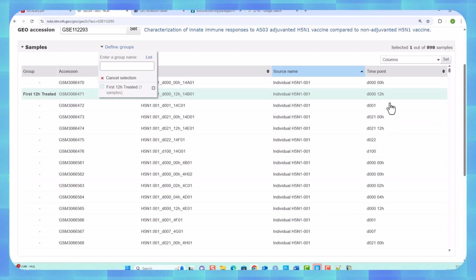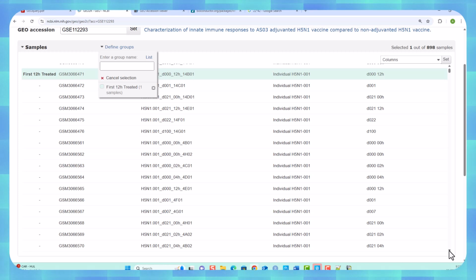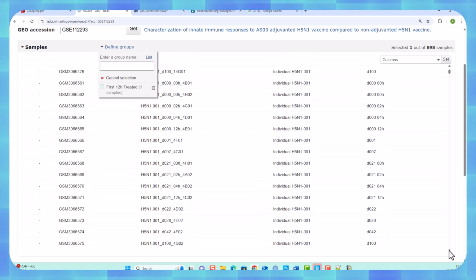The only way of telling is the order they are in this particular list. It would have been a lot more intelligent of the people to put something in here to suggest whether it was from the first or the second collection. So now I have to hope that they've put the data in this folder in the right order.